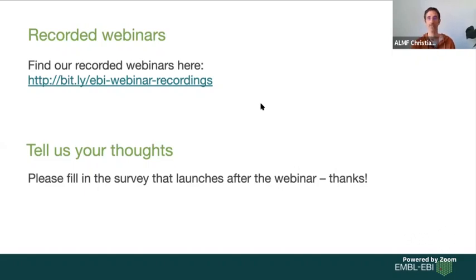Drusha, could you suggest some good methods for processing images with autofluorescence? That's why I had the slide in the beginning. The best is, of course, to work on the sample preparation and not have autofluorescence. For sure, you always have to take control images, so that you're really sure what is fluorescence and what is autofluorescence. And then maybe you can find something that allows you in the final image to automatically distinguish it.